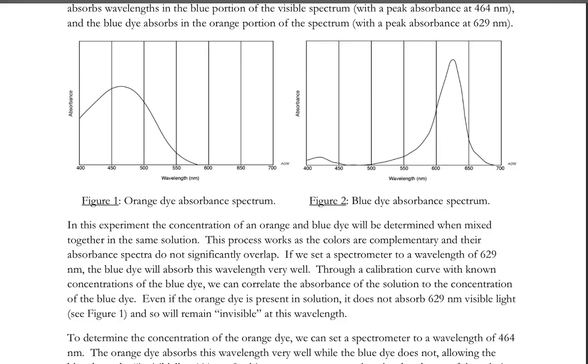A difference between this experiment and the riboflavin experiment is we are given the absorbance spectra. We don't have to measure them. That's what's shown in figures 1 and 2. We are told what the analytical wavelengths are. We're not having to determine those.